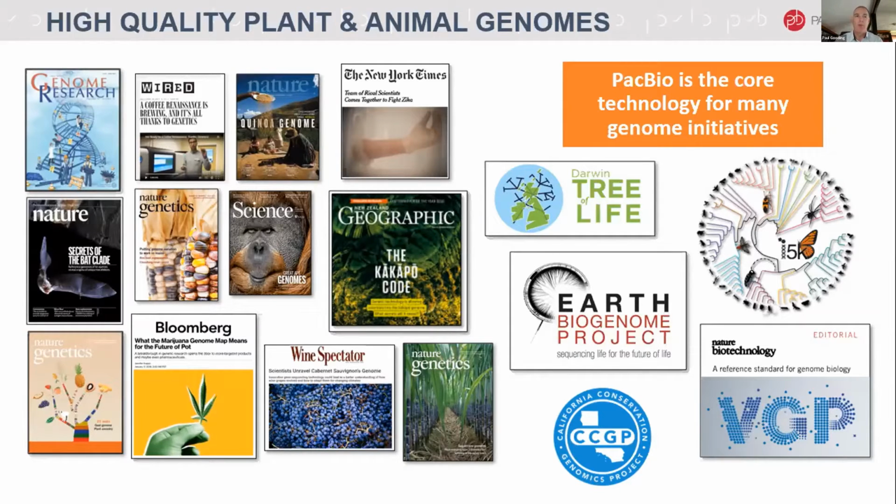They're coming out more and more, and there are huge initiatives out there like Darwin Tree of Life, VGP, Earth BioGenome Project, etc., that are making it their mission to catalogue thousands, in fact probably hundreds of thousands of species and get these high quality reference genomes, and they're all adopting PacBio sequencing as the core technology for building these genome resources.